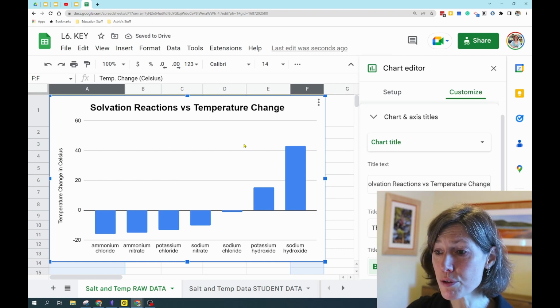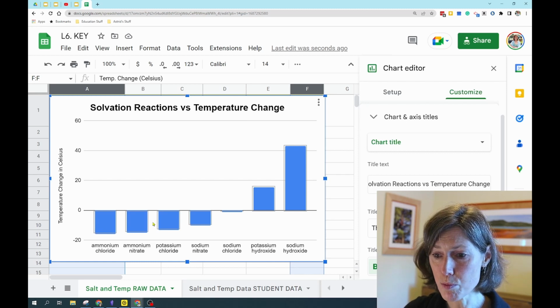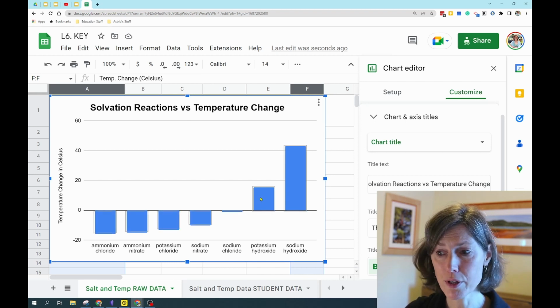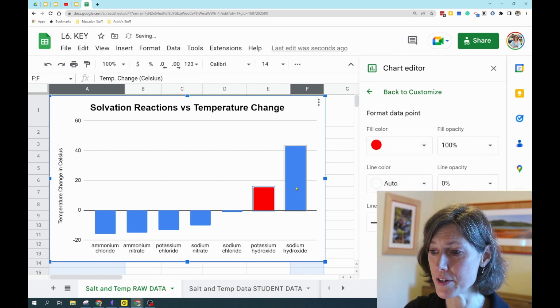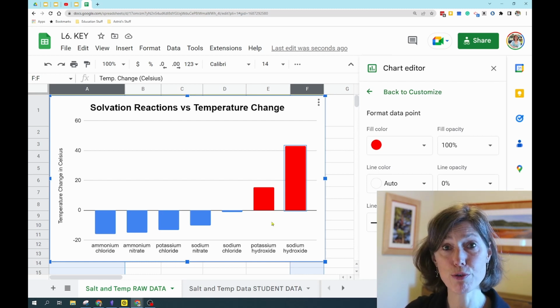The next thing that I like students to do is to make the visual even better. Clearly, the first 1, 2, 3, 4, 5 salt solutions caused a drop in temp, and the last two are a rise. So I'm now selecting, let's see if I can select both of these. Well, let's go with the first one. And I really want that color to show the temp rise, so I want that color to be red. I'm going to do the same thing with the second one, and now it really nicely shows you the 7 different salt solutions, which 5 show you a drop, which 2 show you a rise.